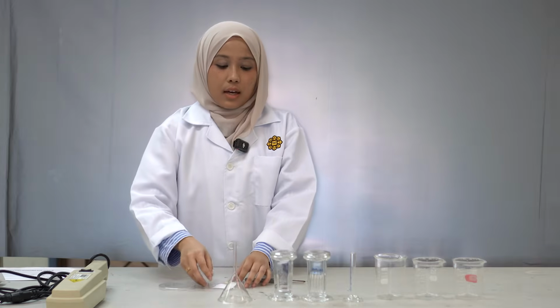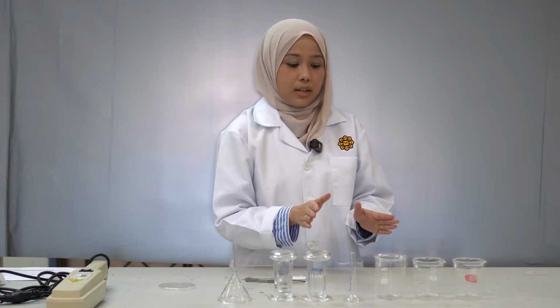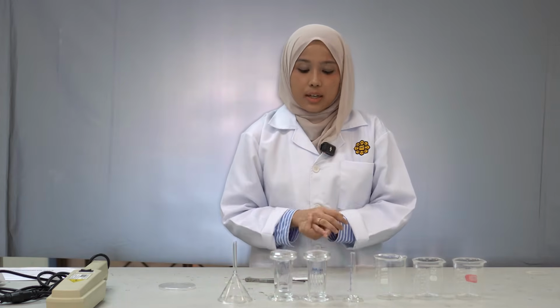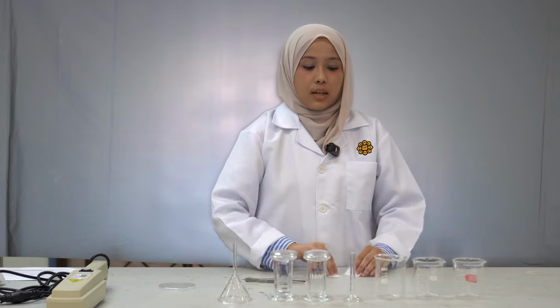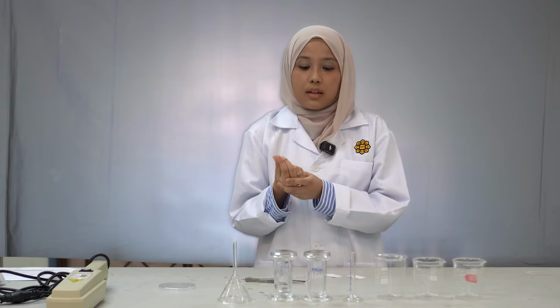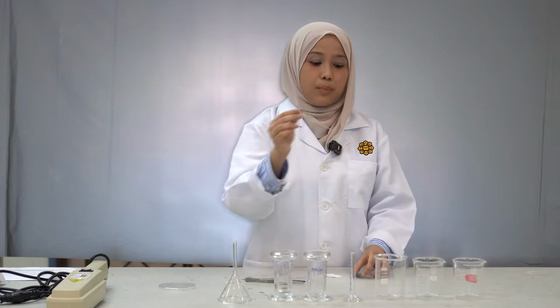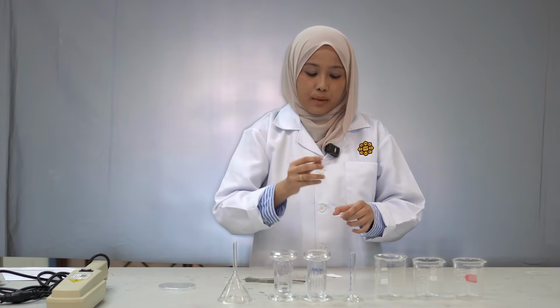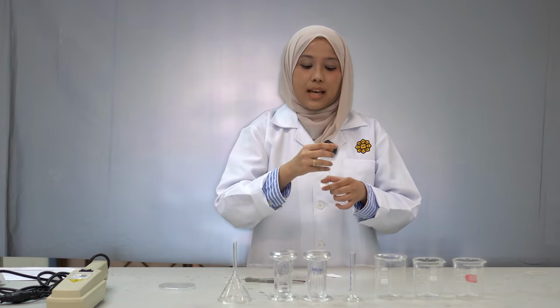After we have prepared the sample, developing solvent, and TLC plate, we will spot the TLC plate with the sample that we prepared. Use a separate capillary tube so that the samples won't get mixed. Put the sample exactly at the labels, acid, base, and neutral.